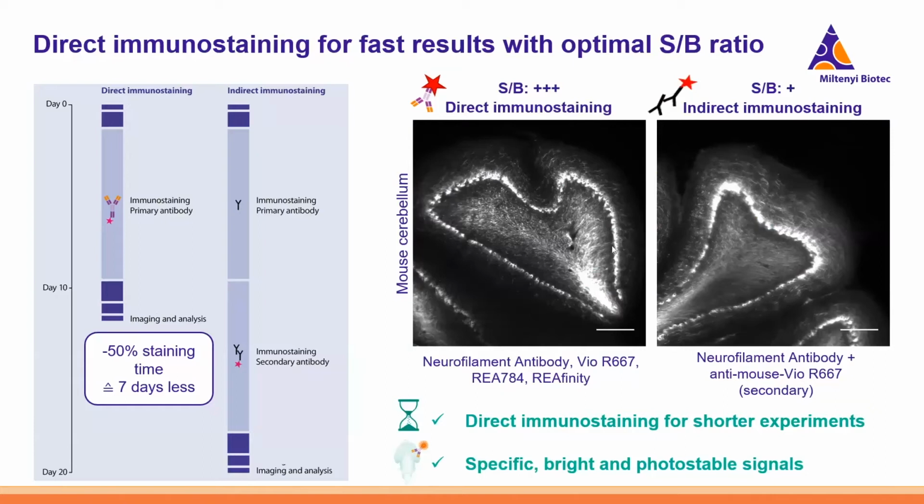And this differs here in the indirect approach. You definitely get a stronger signal, but in the end, what counts is the signal to background ratio for your data analysis. And this is inferior in this example.